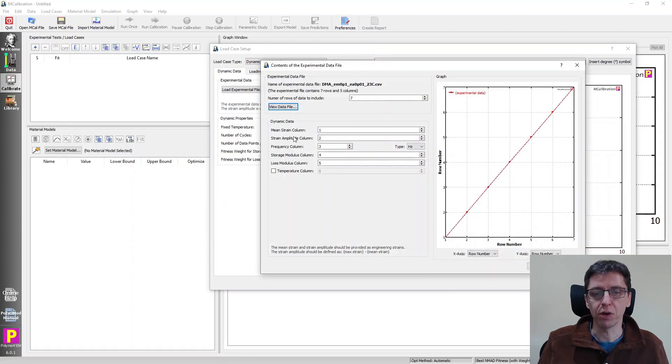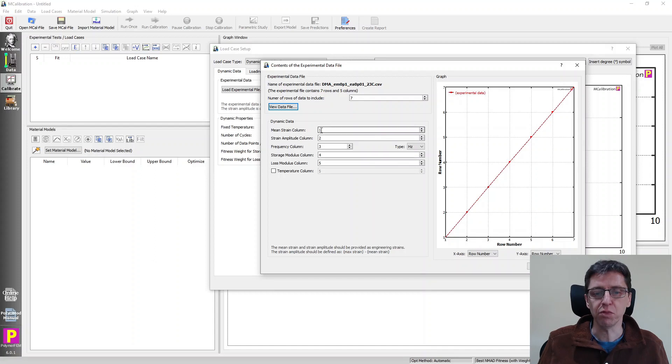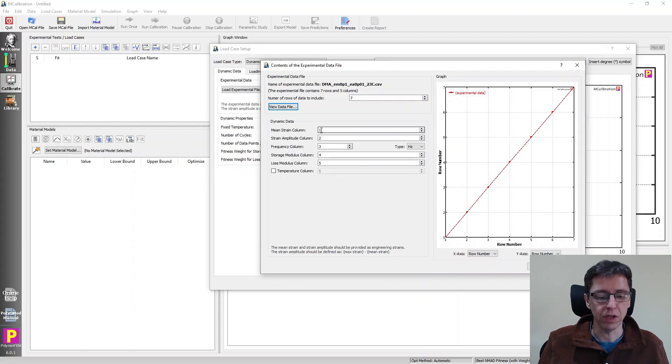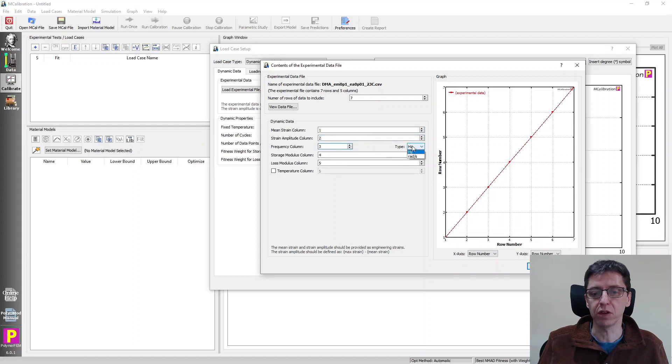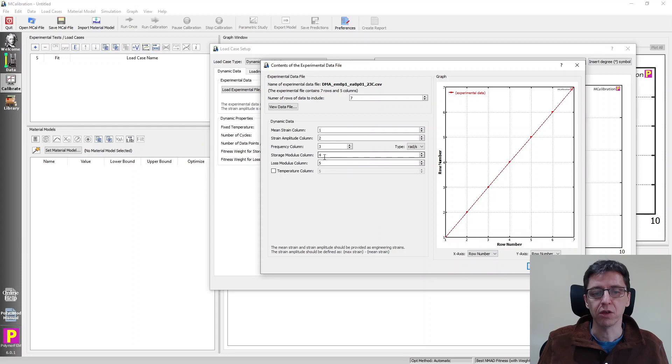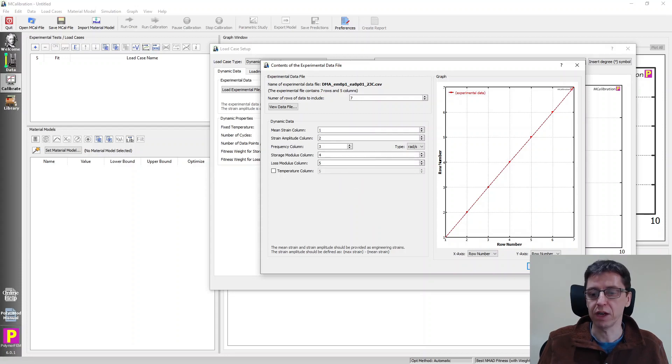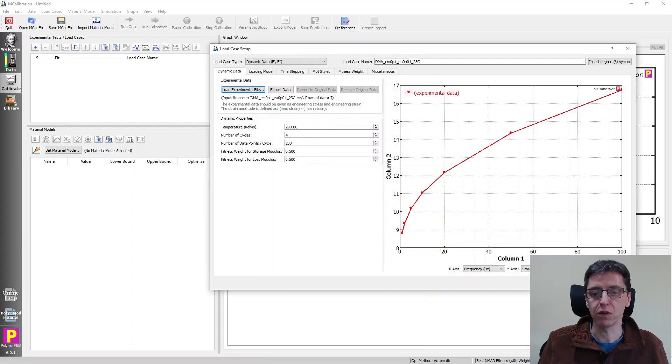And in this dialog box, we'll see that there are seven rows of data and we have to specify now to the software which of these columns contained what data. So in our case, the mean strain was in column one, the strain amplitude was in column two, the frequency column was three but it was in radians per second not hertz, so I switched that one. Storage modulus and loss modulus. So that's the input that we have. So we can say okay.